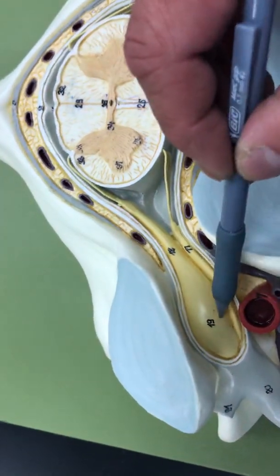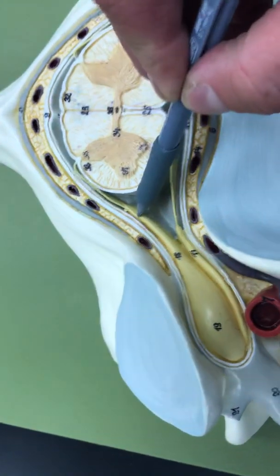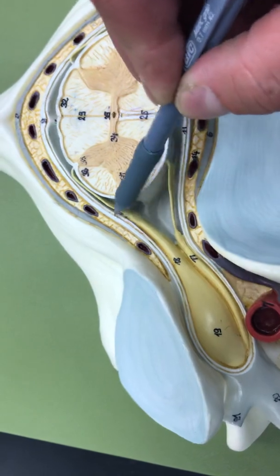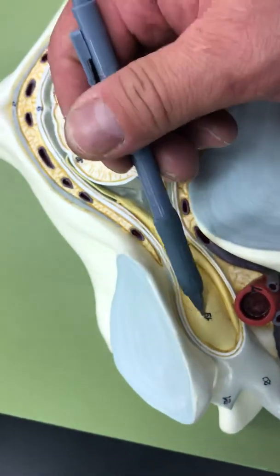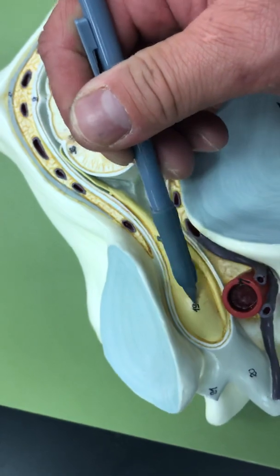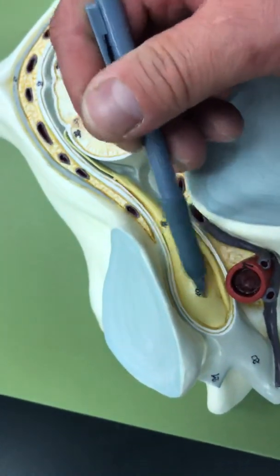These are the cell bodies of the sensory neurons that help form your dorsal root. You see the axons coming in, axons extending out. Those axons have to be attached to the cell body somewhere, and here's where the cell bodies are. So the cell bodies of our sensory neurons are found in the dorsal root ganglia.